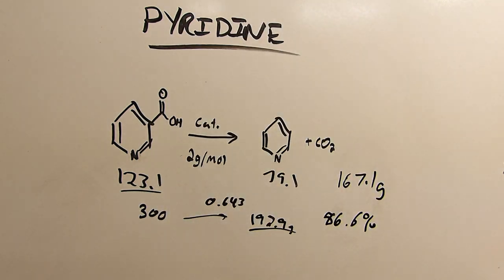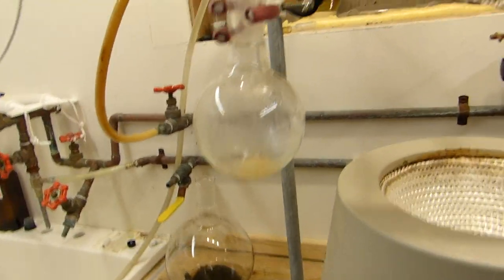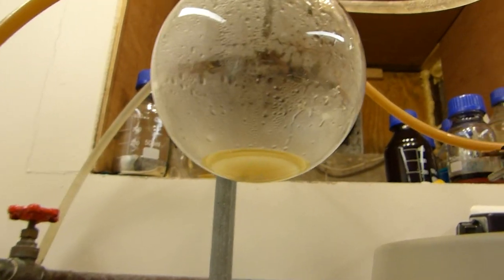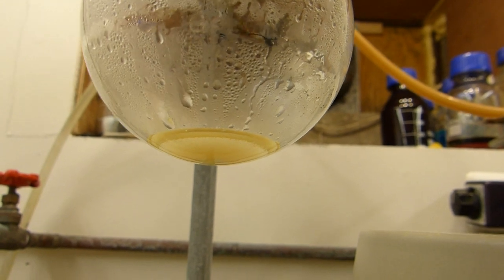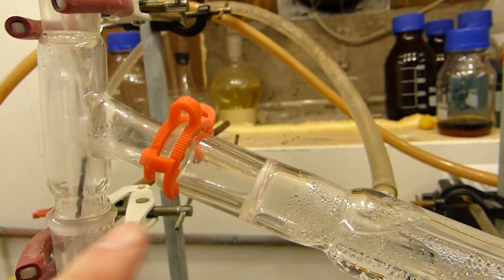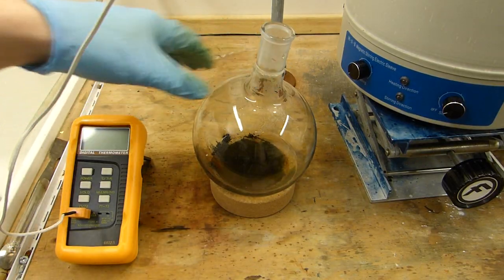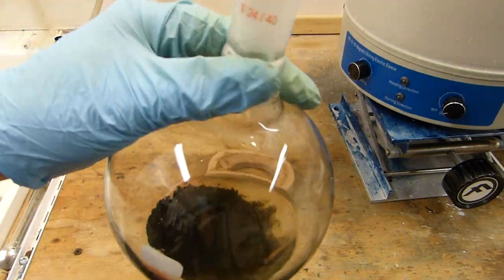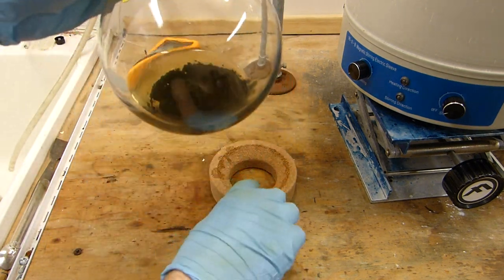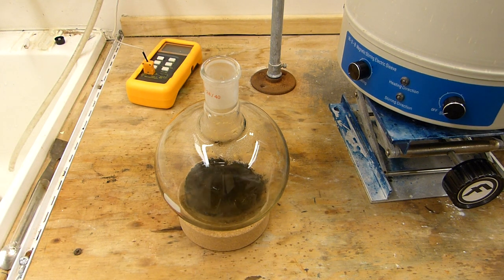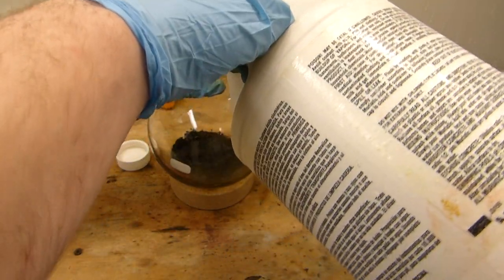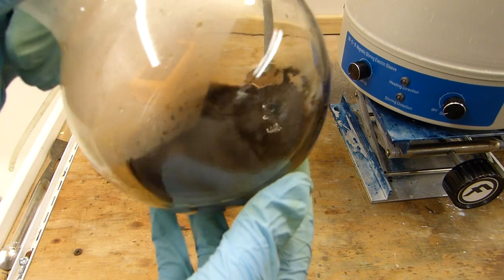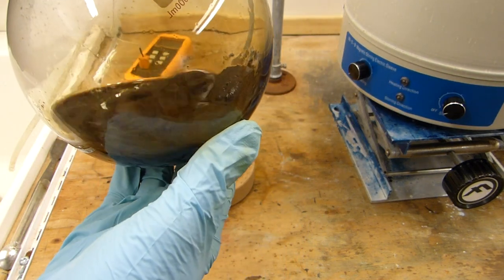Hey before you go I have some additional lab notes. Remember how I was talking about when I reuse the distillation setup, how you could tell if there is any nicotinic acid in the pyridine by seeing if it crystallized out? Well this is what I'm talking about. So you can see here the remnants there, that's the nicotinic acid that came over with the pyridine and you can see it's well crystallized out now that it's cool. So that's what would have happened up there if there's any significant amount. So the pyridine we have is quite pure. Another note is that for cleaning this flask here, this is the reaction flask, the initial decarboxylation flask. You see it's got some tarry crap in the bottom as well as some catalyst. It's been soaking with warm water and you can see warm water has removed pretty much everything else which is water soluble. But to remove that last bit of gunk, all you gotta do is add a little bit of HCl, let it sit for a little while. Let me show you what I mean, I'll get some right here. And we'll swirl this around and you can see by the color that it's taken off the residue quite handily. And yeah in a minute or two this will be ready to just be neutralized and dumped in the heavy metals waste, chromium after all.